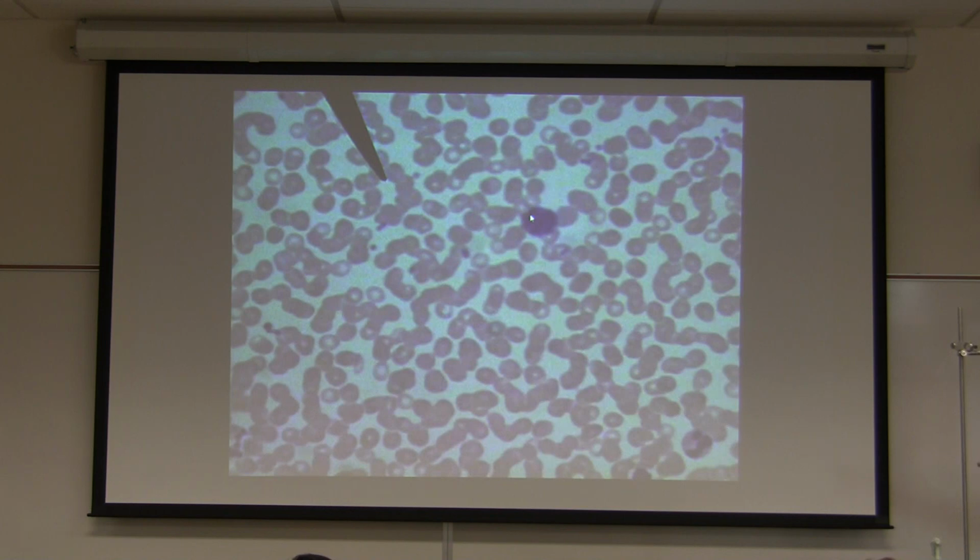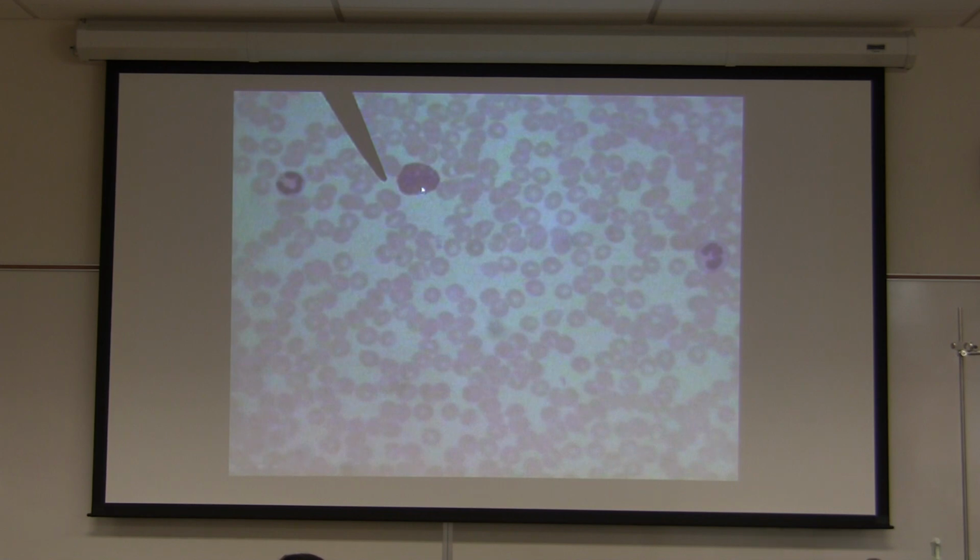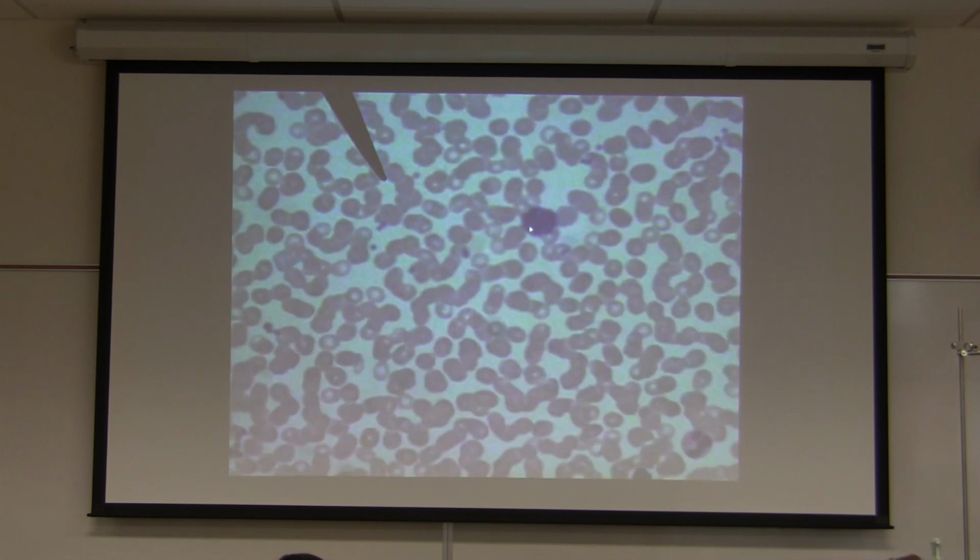You did see them there, both eosinophil and basophil. I put them on demo microscopes there. Did you take a look at them? Fine. You did not take a look at them? Fine. Okay? But it could be in the exam. It could be in the exam. So anyhow, neutrophil, basophil.